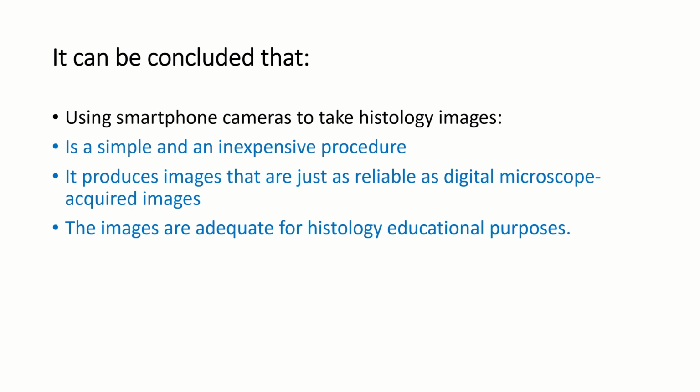In conclusion, using smartphone cameras to take histology images is a simple and inexpensive procedure and produces images that are just as reliable as digital microscope-acquired images for teaching histology.